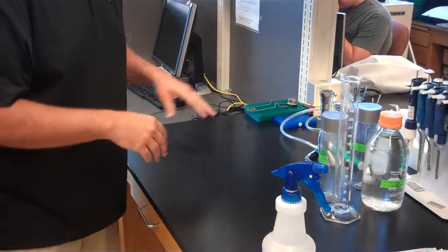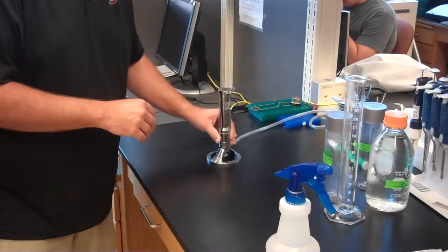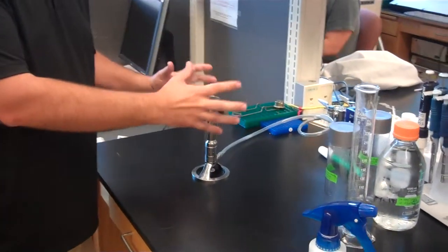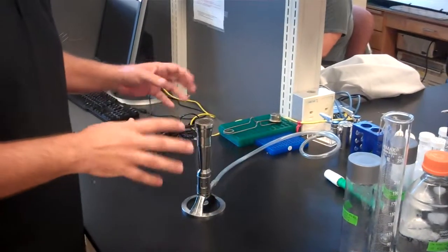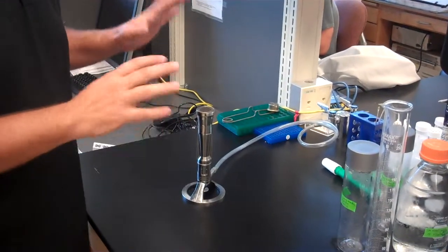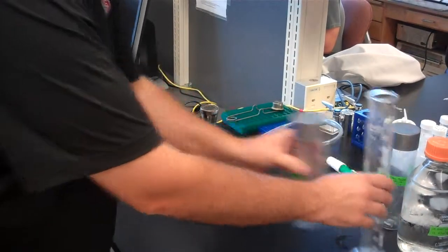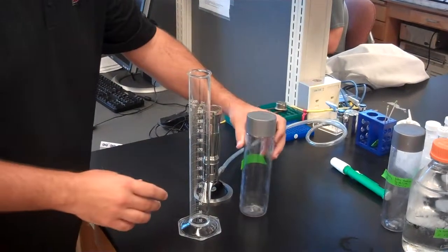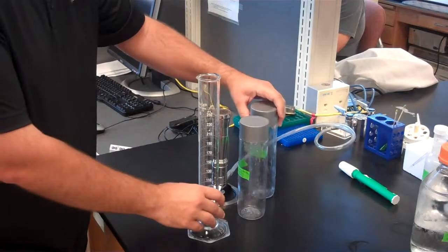And then I'm going to put my materials in place. Go ahead and set up your area. So the first thing I'm going to put right in the middle is the Bunsen burner. This is what is going to create the 10 centimeter sterile field. And then I want to set this up so that the materials are easy for me. I'm a lefty, so it's important for me to have everything set up so that when I pour, I can still keep everything in the sterile field.